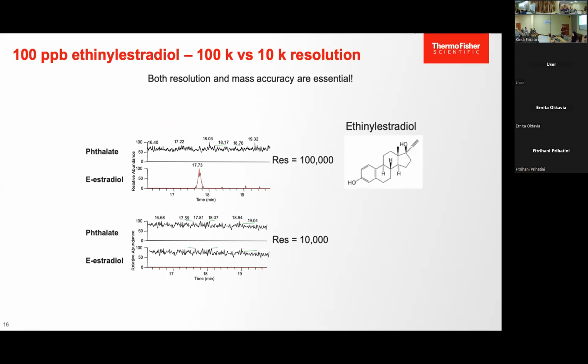This ability to do data mining helps very much in screening, and it will help you differentiate that maybe 10,000 for this sample is not sufficient, and the requirement is that you need to use 100,000.